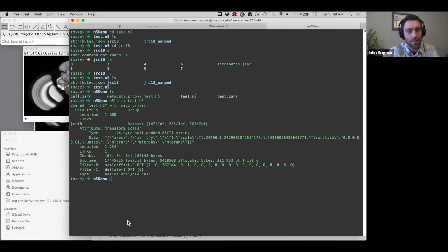I think users will want to have the image locally because their experience so far is that they work with local images, and working with anything that is not local is difficult. So software developers here need to make the experience for things that are not local as good and as seamless as things that are local.